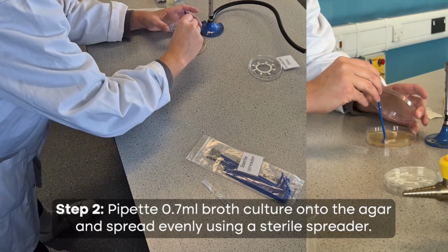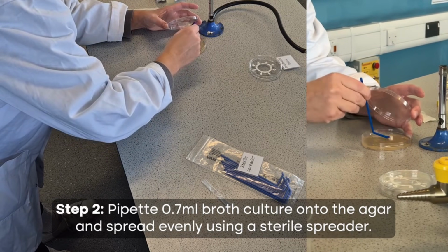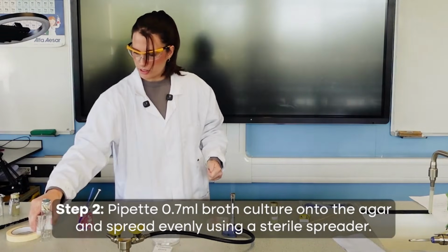So I tend to just go around it almost like a clock face, just to make sure we're definitely getting all the way to the edge of the agar plate. And then immediately the spreader is going into the Virkon. That's the last step, just putting the antibiotic disc on.